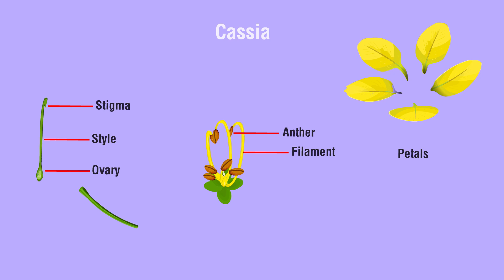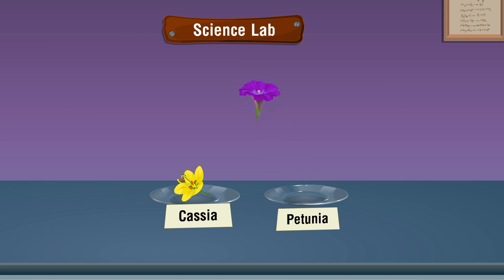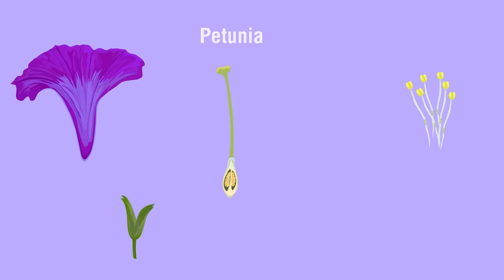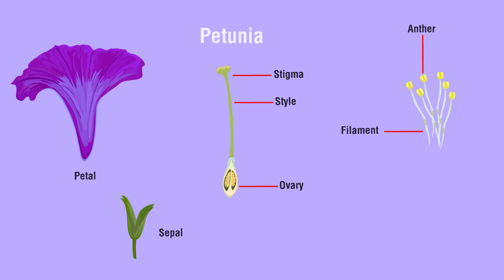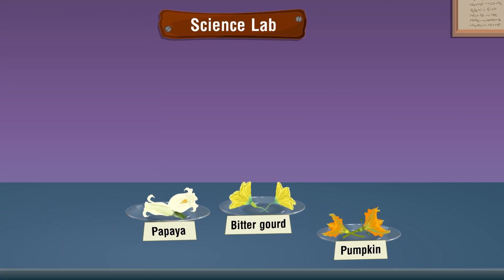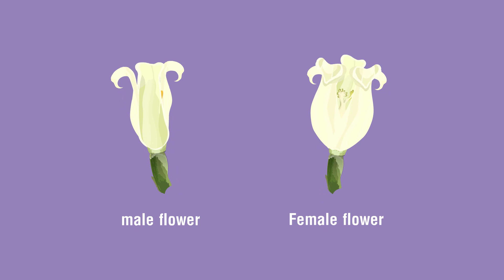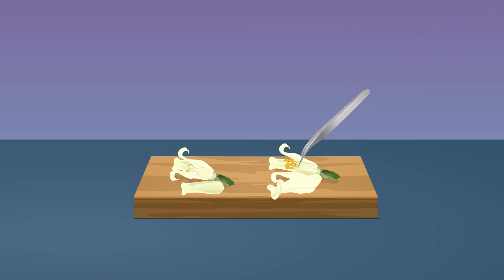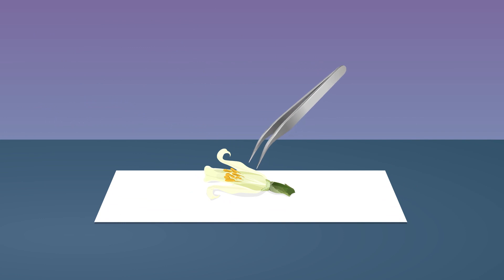The small stalk-like structure supporting a single flower is called a pedicel. Now let's study unisexual flowers: Papaya, Pumpkin, and Bitter Gourd. Take both male and female papaya flowers from the watch glass. Keep the flowers on top of the wooden board. Cut the male and female flowers vertically into two halves using a blade. Place a white sheet of paper over the table and arrange all the floral halves on paper using forceps.